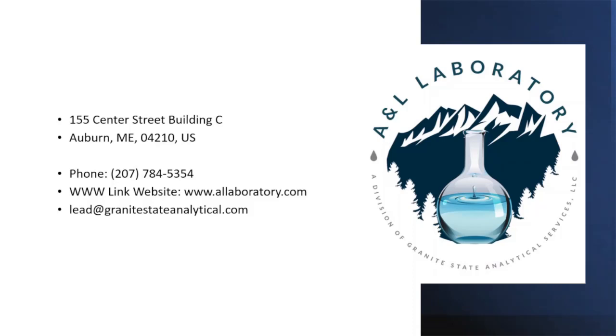After analysis, A&L Lab will provide your school with the sample results. Please note, both ordering and returning your drinking water samples is free. You do not need to pay for postage.